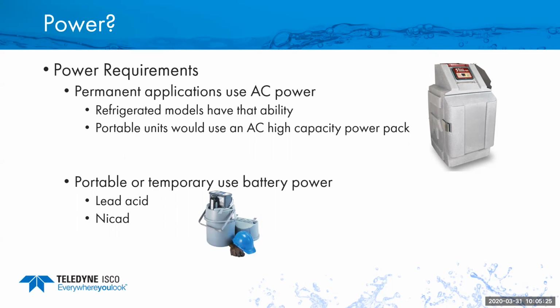The biggest advantage for a lead acid battery is that they generally are more powerful and last longer than the NiCad. The disadvantage is that you can't discharge a lead acid battery all the way. If you fully discharge it down to 1 or 2 or 0 volts or something like that, you can actually harm the battery. So you really don't want to discharge it all the way. If it's a site that you can't get to in time, and the sampler is going to stay there and keep running, then you probably don't want to use lead acid, because it could damage the battery if it does drain down to nothing.